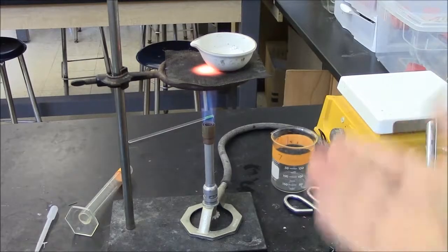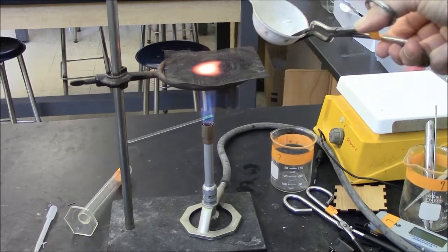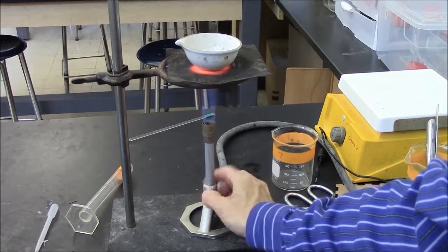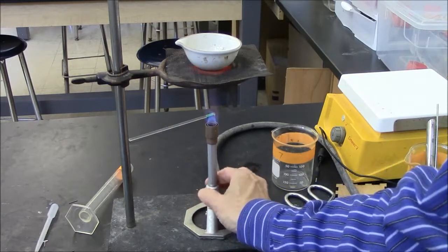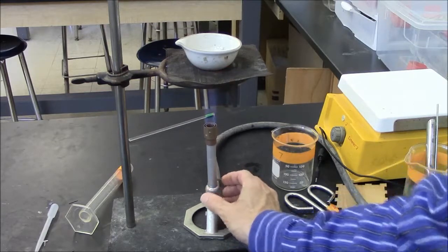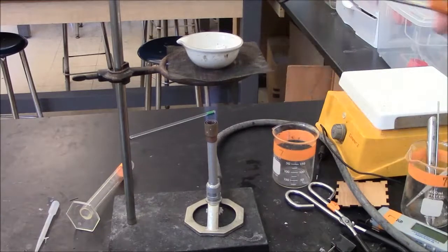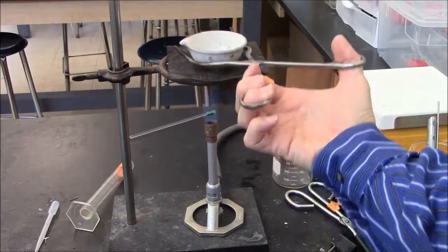You'll want to use a Bunsen burner to dry out your material in the end, but if you have a big hot fire like this where it glows, then that'll be way too hot. So adjust your flame, take away some of the air and a lot of the gas until you have a tiny flame, something like that, and you can see the wire's not glowing anymore. When you use your tongs, securely grip the edge of the bowl. Don't try to balance it like that.